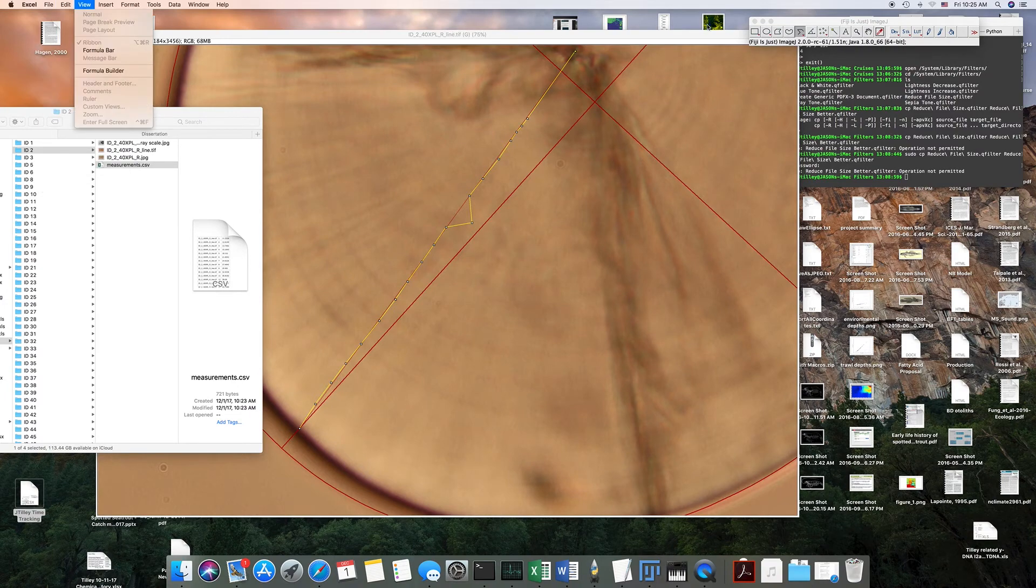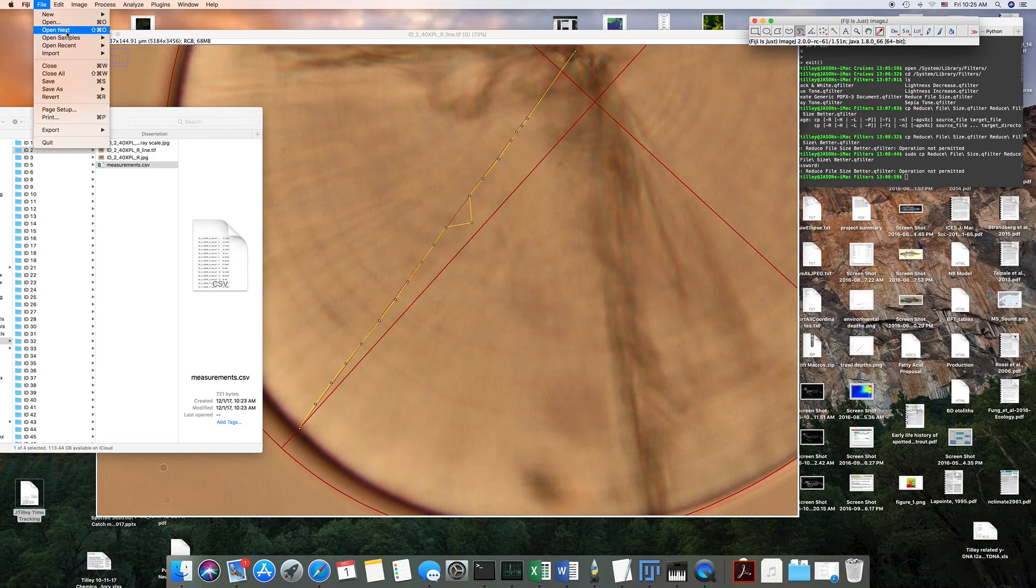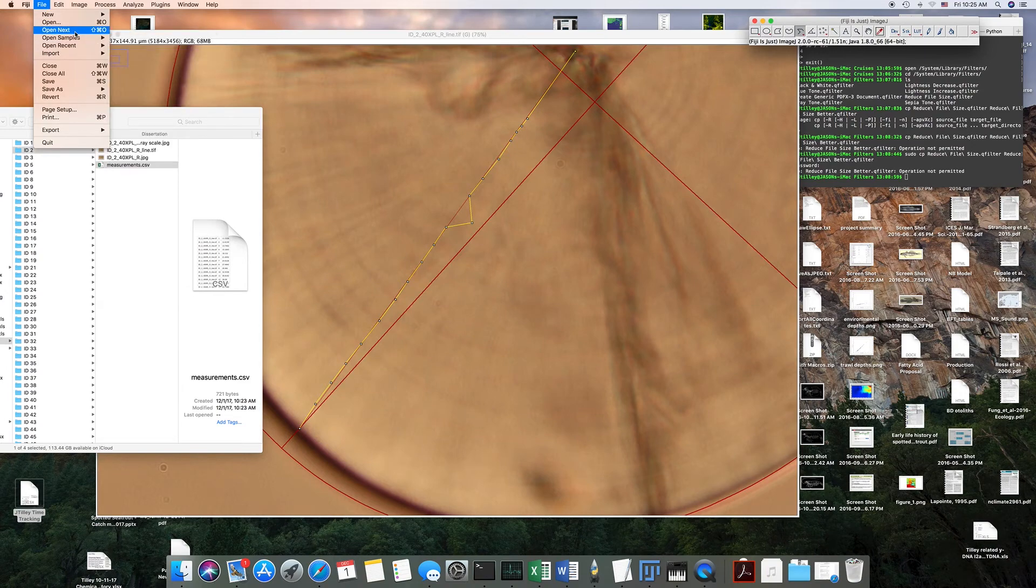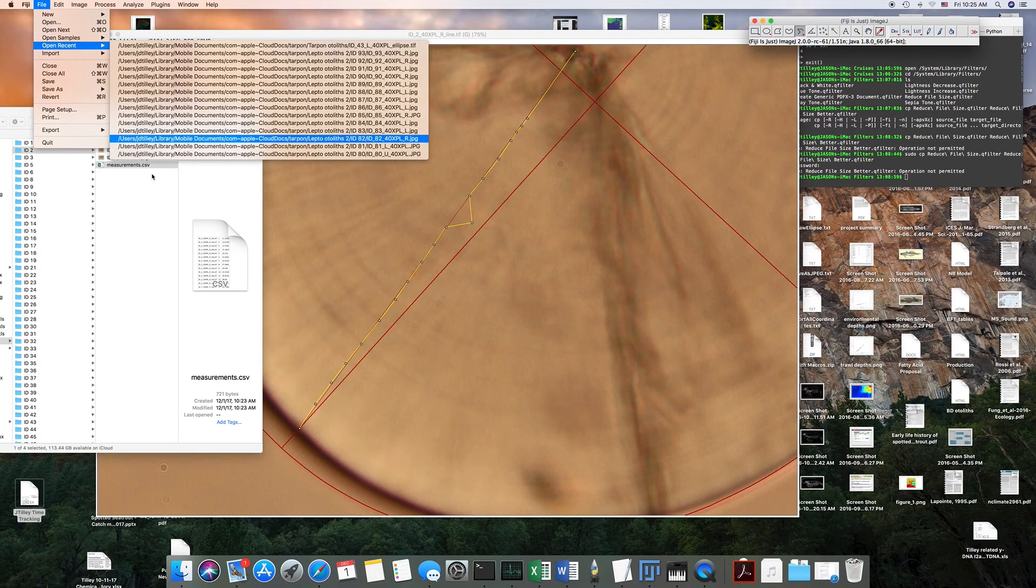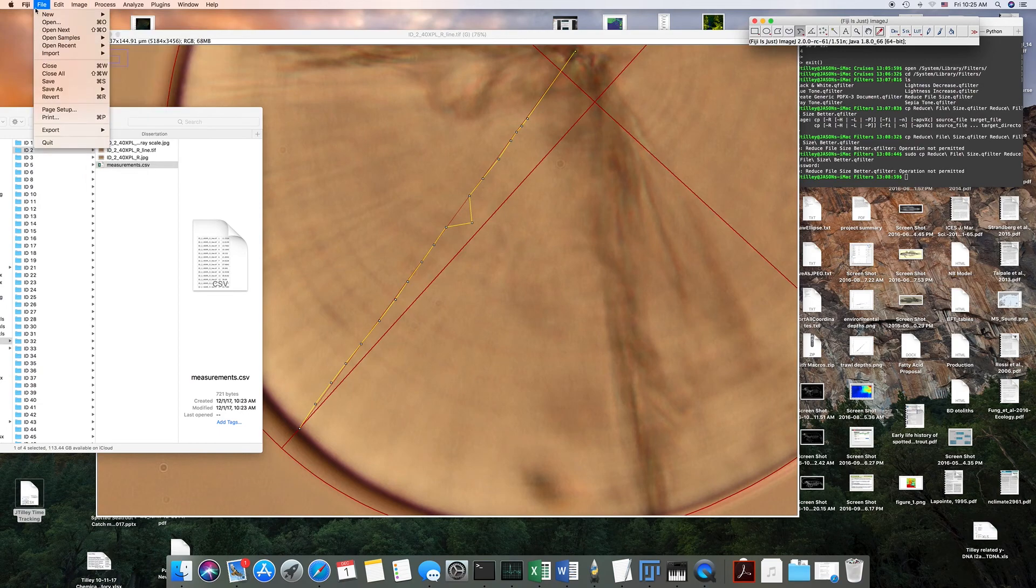Otherwise, when you go to open one of these files, you can easily just say open next, which in this case would open up this image.